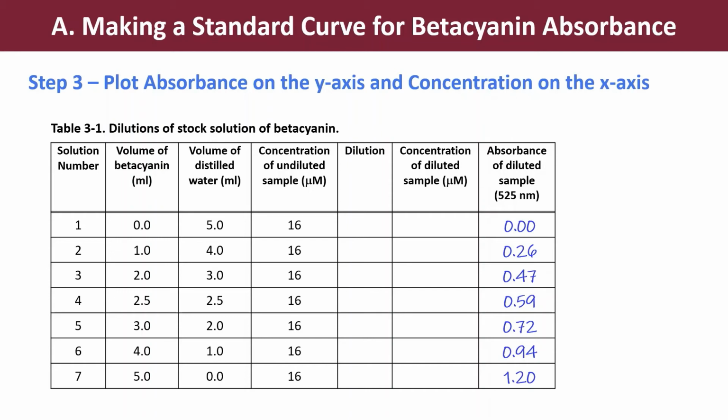So you can see I have all my absorbances there in the final column. You will have to determine the concentrations and the dilutions. That is going to be your job. If you take a look in the lab manual, there are instructions on how to do so if you're not sure how to do these kind of calculations. You can always contact me if you have any questions.